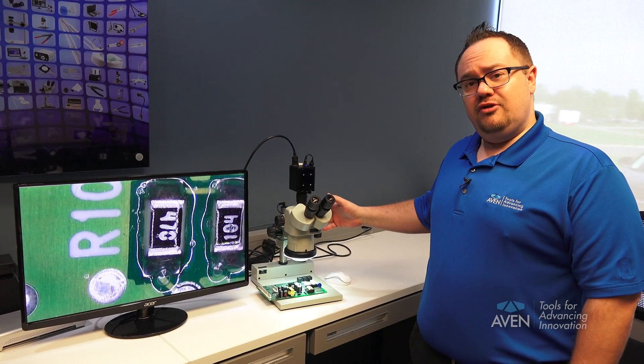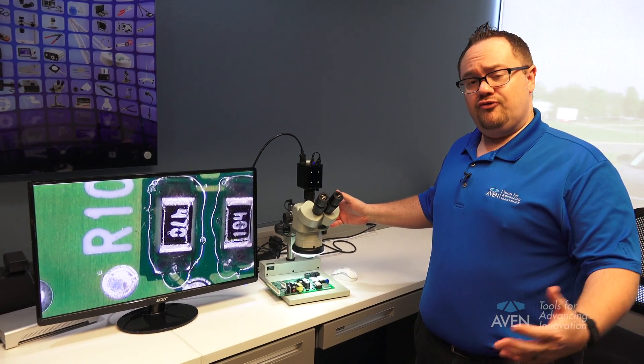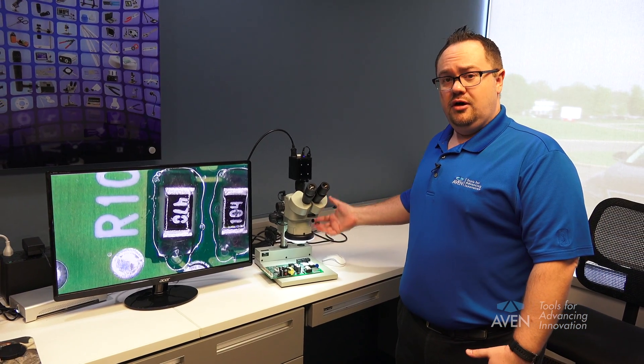Parfocaling means you can keep the microscope in focus all the way through the dynamic range from low to high magnification without having to move the objective up and down.